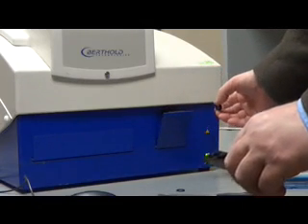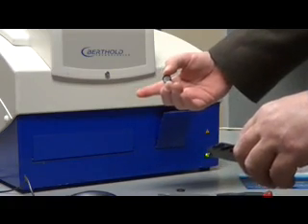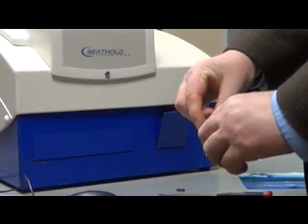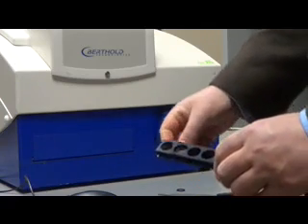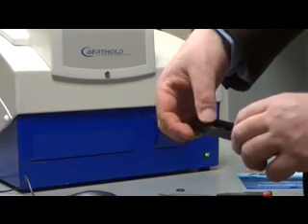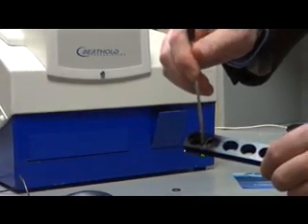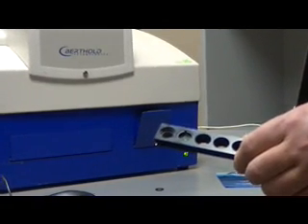We look for the arrow on the filter and put the arrow with the light path. The light path is always from the right, so the arrow should be pointing in this direction. We drop the filter into the filter slide and then install the clamping ring. Then we take our small screwdriver and tap down gently on the clamping ring all the way around, because we do not want the filter to be askew inside the filter slide.